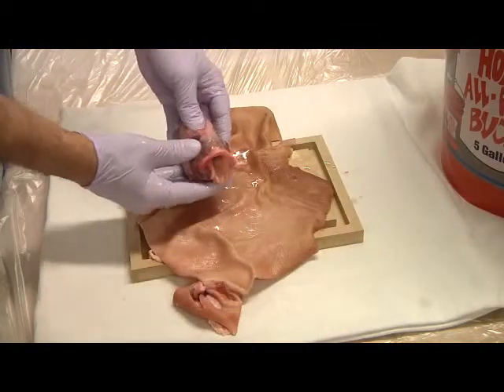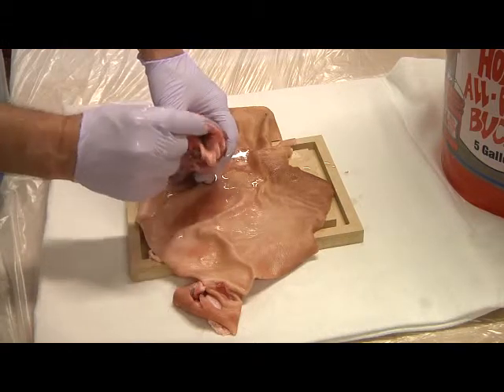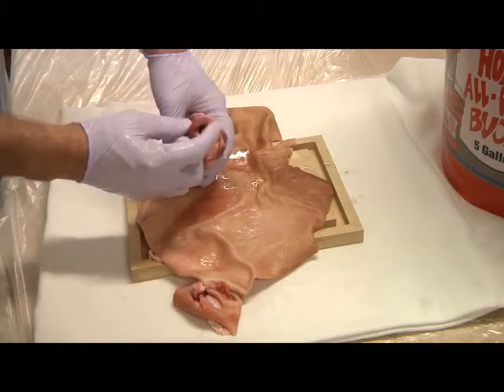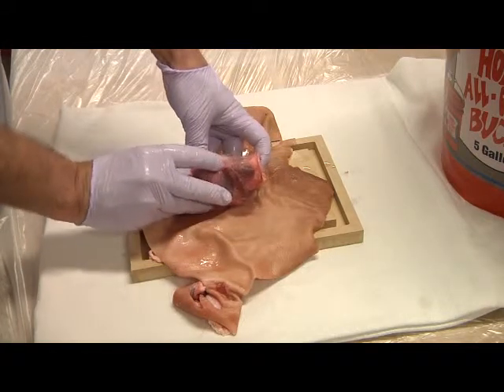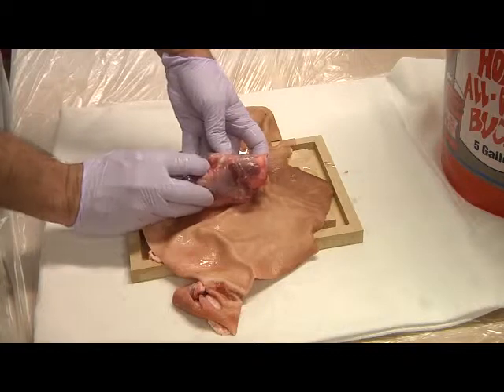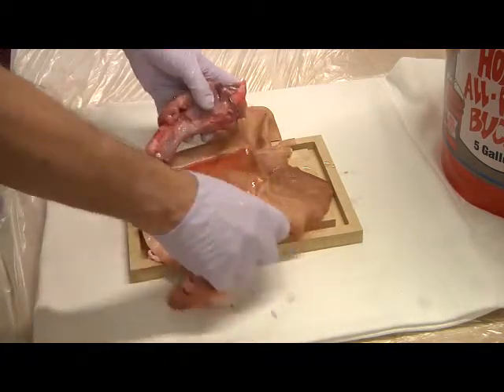Here's a much more intact specimen. The arytenoids, aryepiglottic folds. Here we have what's left of the thyroid cartilage. In fact, I think that for the most part it's intact. And then as we palpate down, we'll find the cricothyroid membrane on this specimen way down here. So quite a long thyroid cartilage.